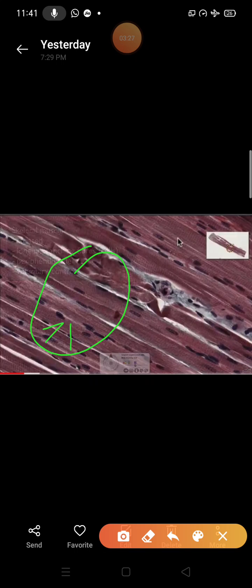This is the picture of peripheral nuclei. And that's why this cell is also known as multinucleated.